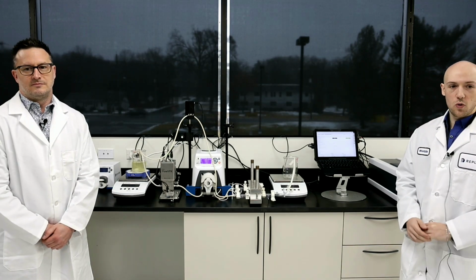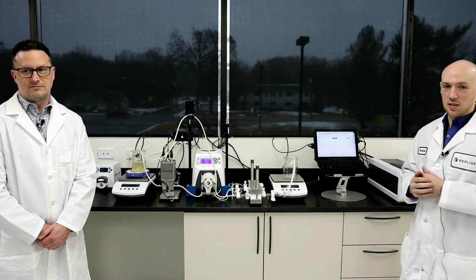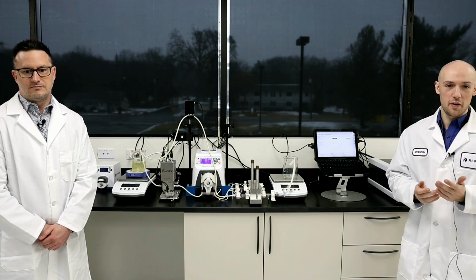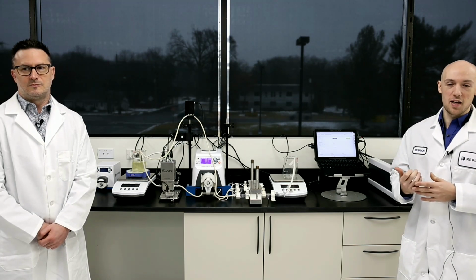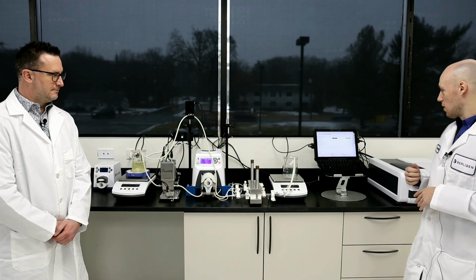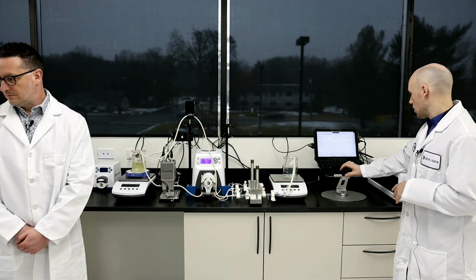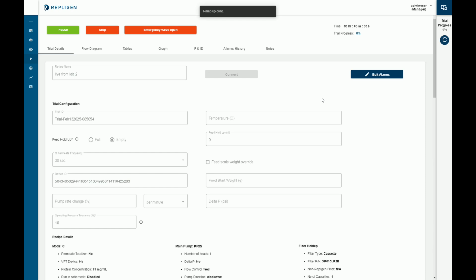However, before we actually get into details, I do just want to start the actual process itself because I'm sure a lot of you guys are aware that UFDF does take a while. And so just so we have some data at the end of this and that we concentrated up a good amount, I'm going to hit start right now. So I'm basically just starting the main pump and everything so that while we present to you guys and actually go over the system, we'll actually be able to at least double or hopefully triple our concentration.